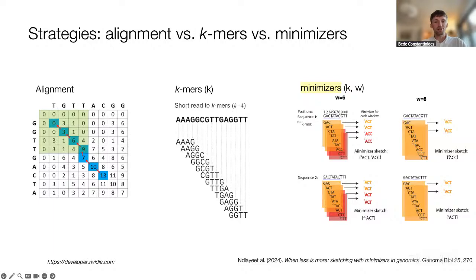So it's a compression technique, often called a sketch, that allows you to extract representative landmarks of your genome for fast analysis of any kind. And so minimizers reduce the number of k-mers you need to store enormously, with only a modest reduction in sensitivity for sequence matching problems. And these are really widely used. And this is in part how tools like Kraken 2 work.